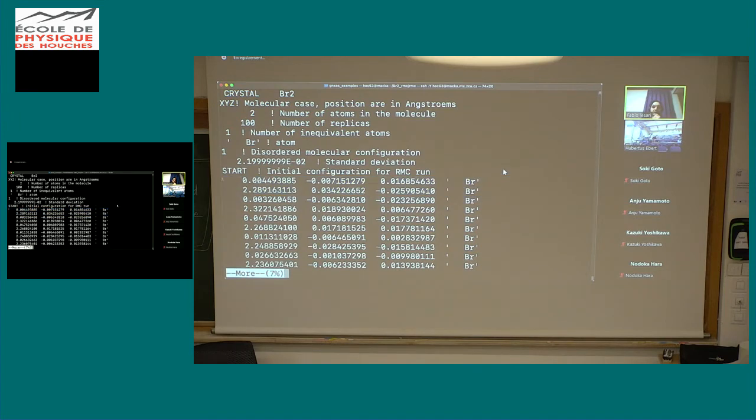Sorry to interrupt. Is it somehow possible to visualize this, like with a graphical visualizer?